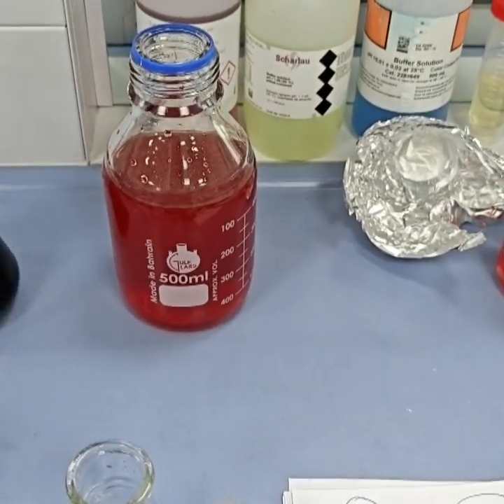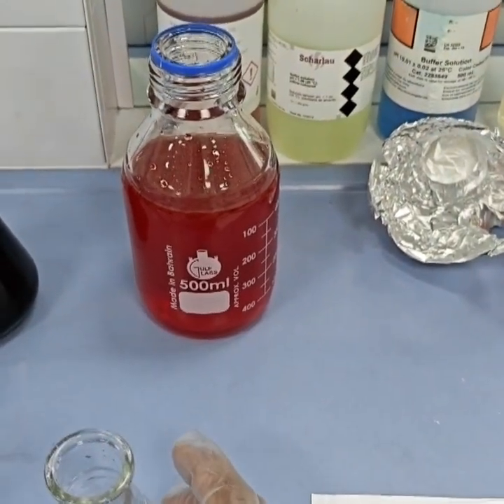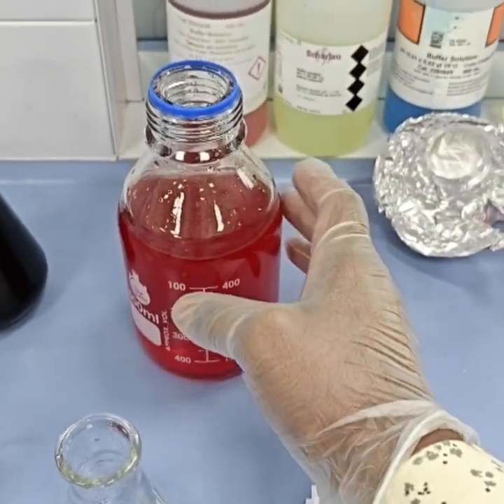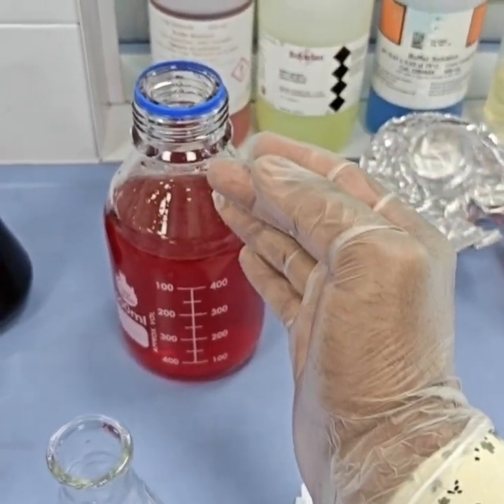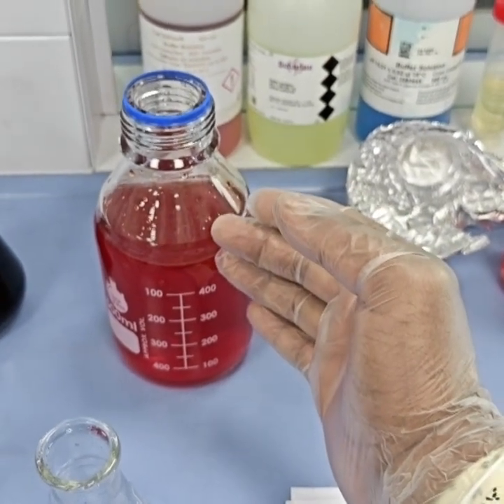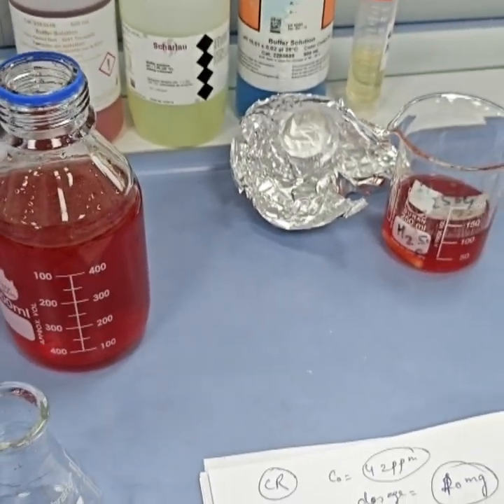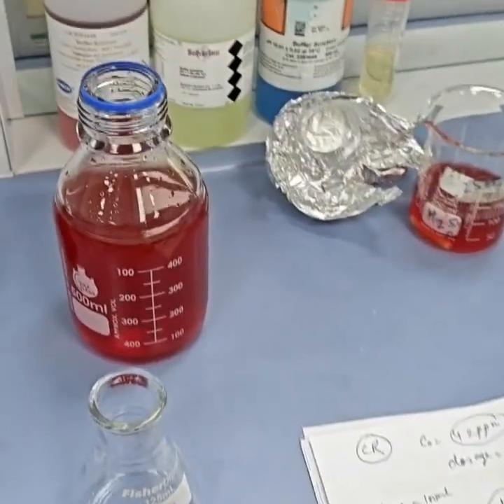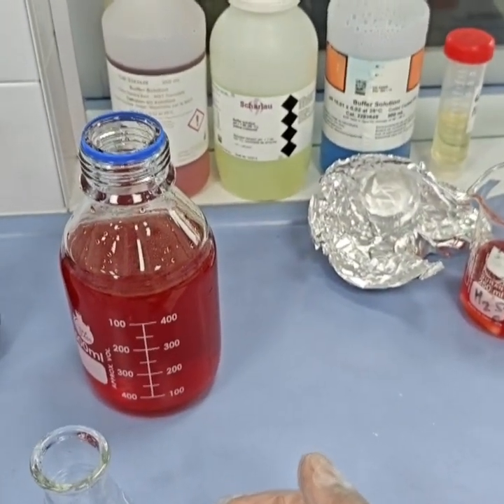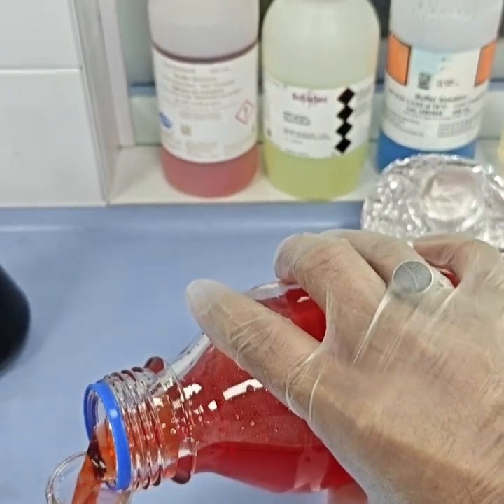So let us fix today's discussion on finding the operative ranges of the dye. Suppose this is my Congo red dye. Based on my experience, I know that this dye is operative from 4 to 8 or 4 to 9. I cannot go below 4, but I can go above 9 or 10. Usually when we lower the pH, some of the dyes start to precipitate.